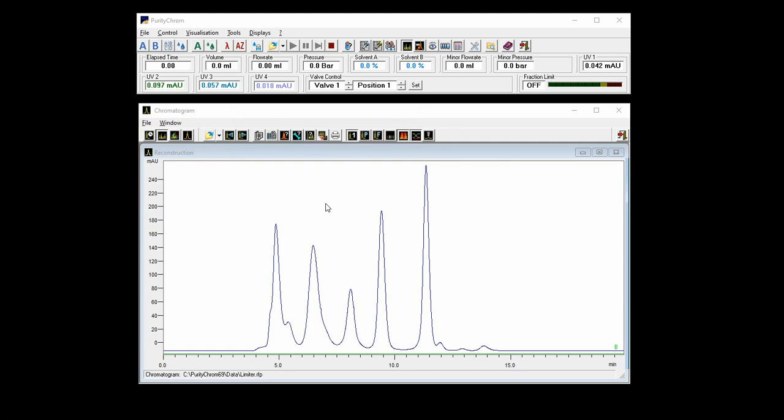What you see here is an example of such a run in which peaks are fairly well separated. However, you can also see some minor shoulders over here or some minor impurities over there. When carrying out these kinds of purification runs, you have different possibilities on how to fractionate and automatically detect different peak situations using PurityChrome.